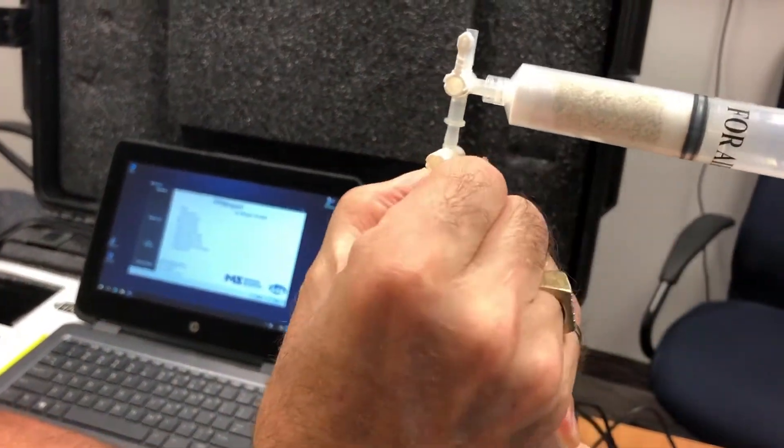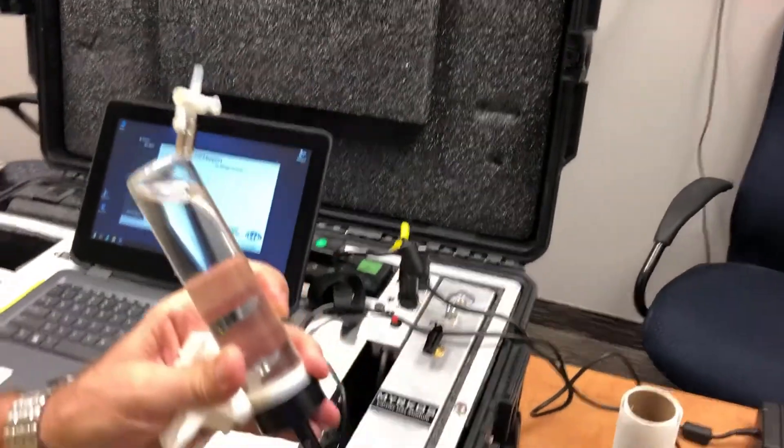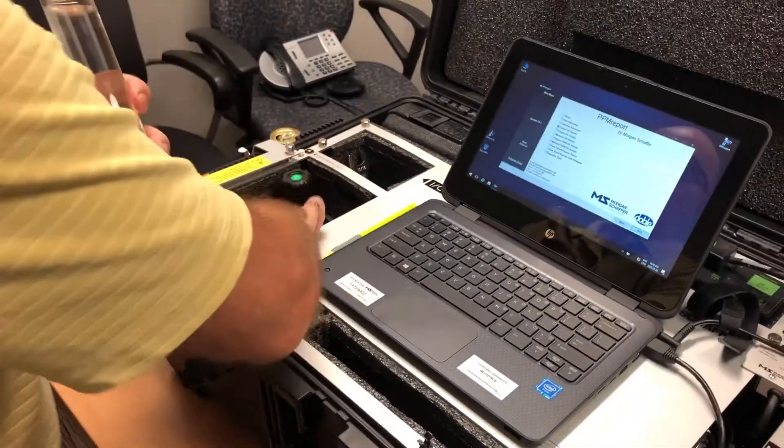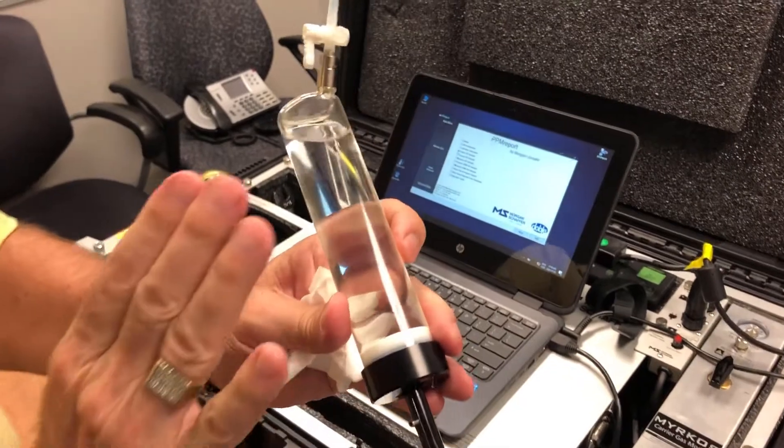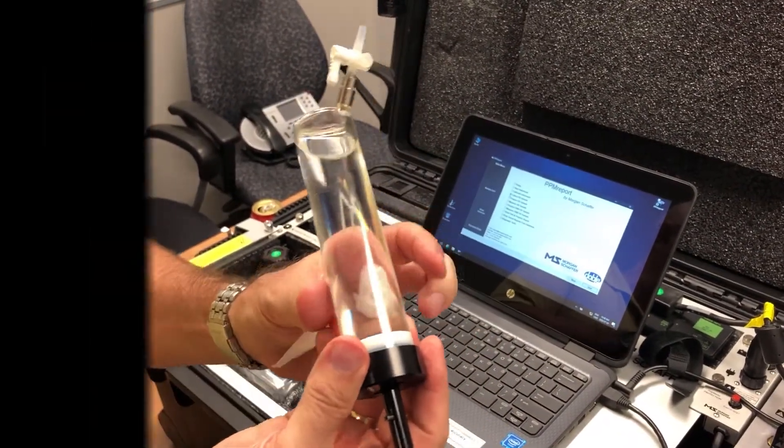Then you close this valve, you close this valve, and you remove the syringe and put back the cap to make sure there's no contamination. So this is your sample that we're going to use now to analyze the oil.